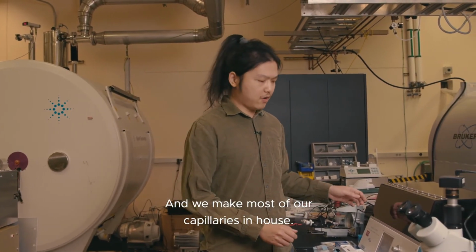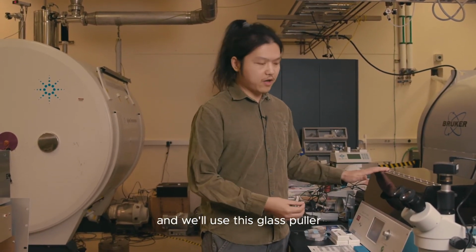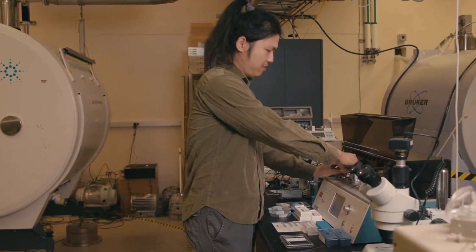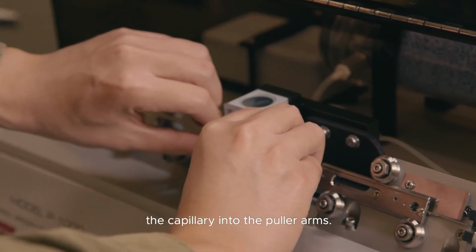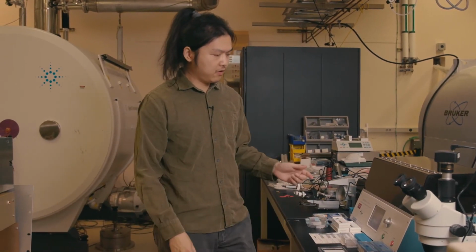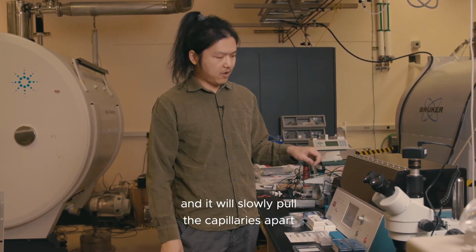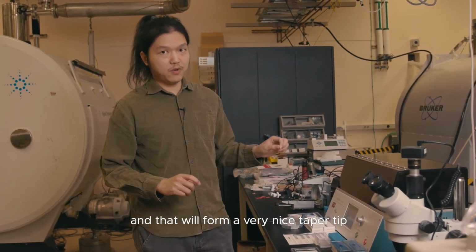So we make nano-electrospray capillaries to electrospray our proteins for native mass spectrometry experiments, and we make most of our capillaries in-house. We have these glass capillaries, and we use this glass puller to make tapered capillaries for the experiment. To do this, we first position the capillary into the puller arms. Once it's in position, we start the pulling by heating up the filament inside. As you will see in a few seconds, the filament will heat up and slowly pull the capillary apart, and that will form a very nice tapered tip.